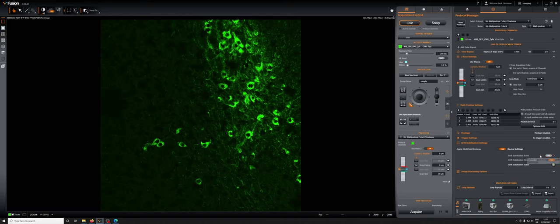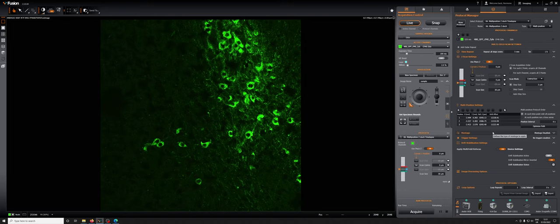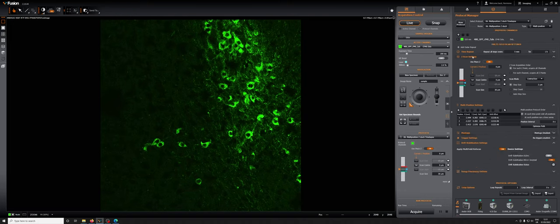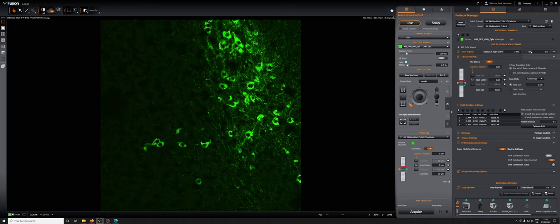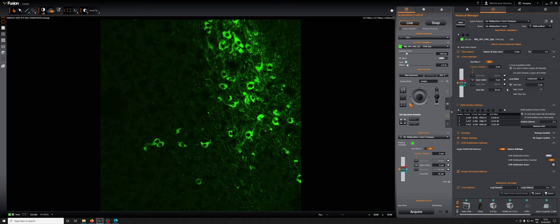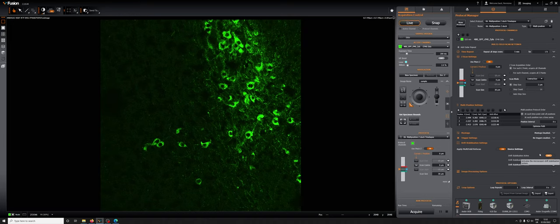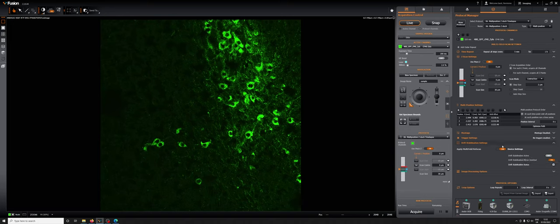We do this over and over for however many points we have. If we enable montage, that doesn't affect this at all. If we do however many time points, that also doesn't affect it at all. The key point is, if you're using the center size design which is the one I recommend, to make sure the piezo is in the center position, click drift stabilization on, add the position, and then do drift stabilization off.